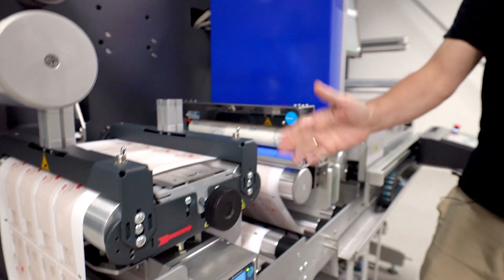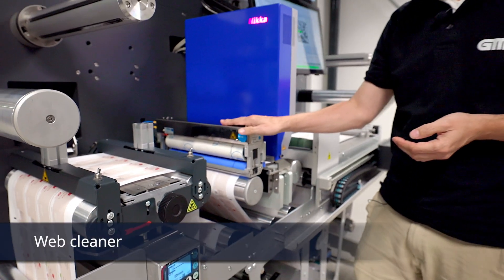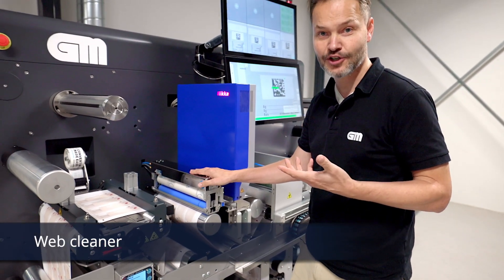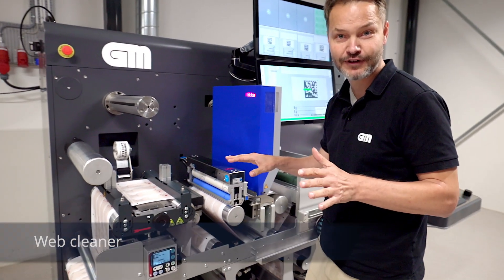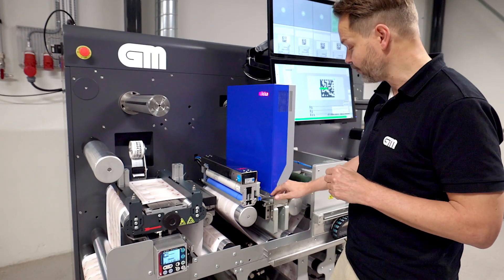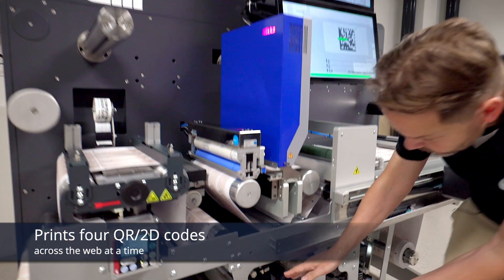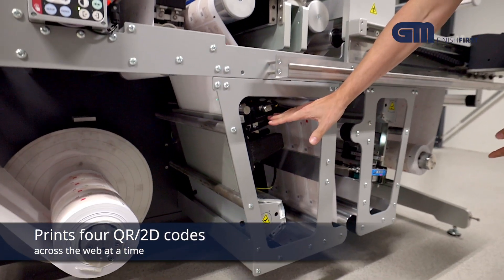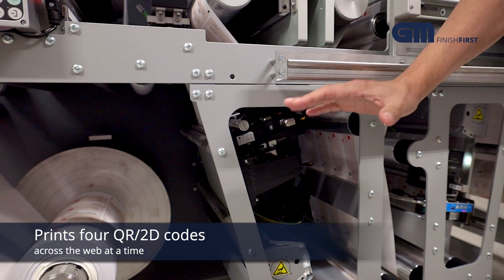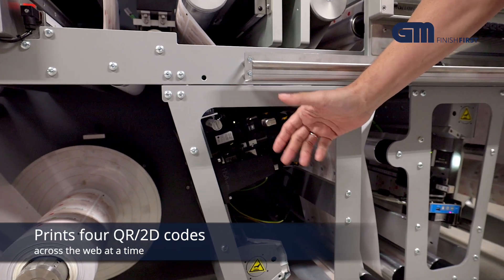After that, we go into a very important item: a web cleaner. When we are talking about printing QR or data matrix codes, it must be spotless — perfect. So we start by cleaning up the web. Then we go into a printer that actually prints the QR code, which sits down here. This printer has four heads, so we can print four QR codes across the web.